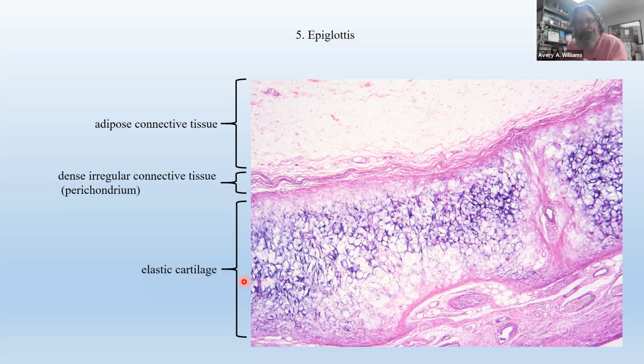So inside lacunae, you're going to have chondrocytes. A chondrocyte is a cartilage cell, because the matrix of the cartilage is firm, it's solid. You know, like you've seen cartilage before, gristle. Have you ever had gristle from a chicken bone or something like that? Not the bone, but the cartilage, it's the gristle.